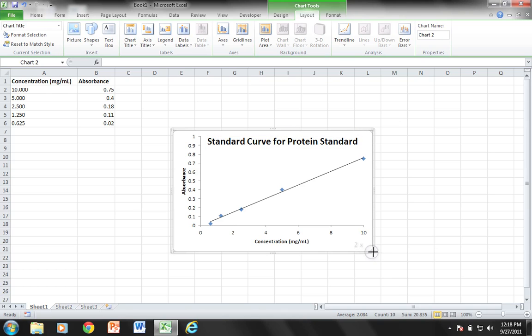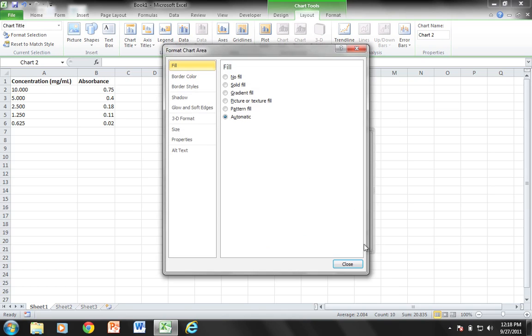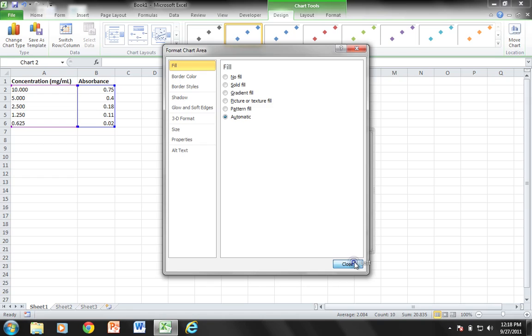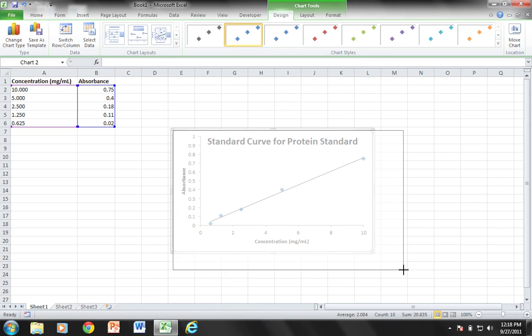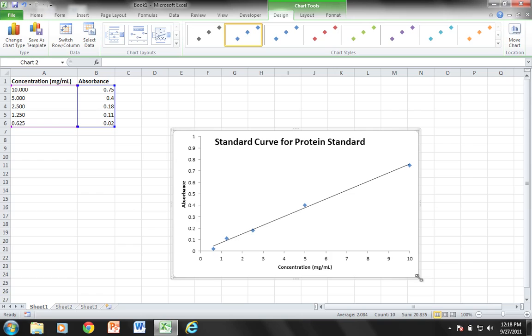There we go. That's all there is to it. I now could use this standard curve to help me calculate the relative concentration of an unknown solution if I were able to obtain the absorbance of that solution.